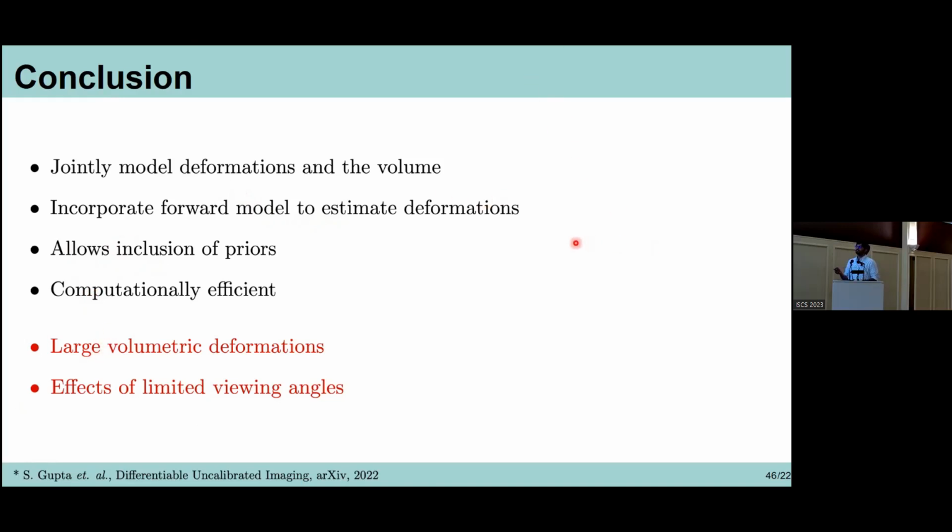The compute we looked at was in terms of training, but we didn't implement a faster version of the forward operator itself. We were more looking at how to speed up the training process rather than the forward operator.